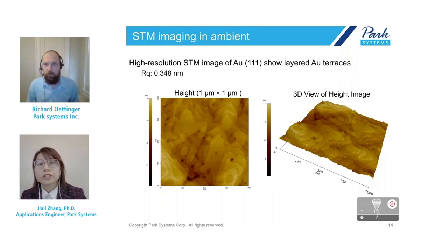Usually, if you image, you can see it from the images you have taken. When you compare from the beginning and at the end, if you see some artifacts, such as the granule domains become bigger, or you see some triangle features, that means the radius of the tip is getting bigger and the tip is getting dull. And that is how I quantify. I use AFM imaging as a way to see whether my tip is good or not.